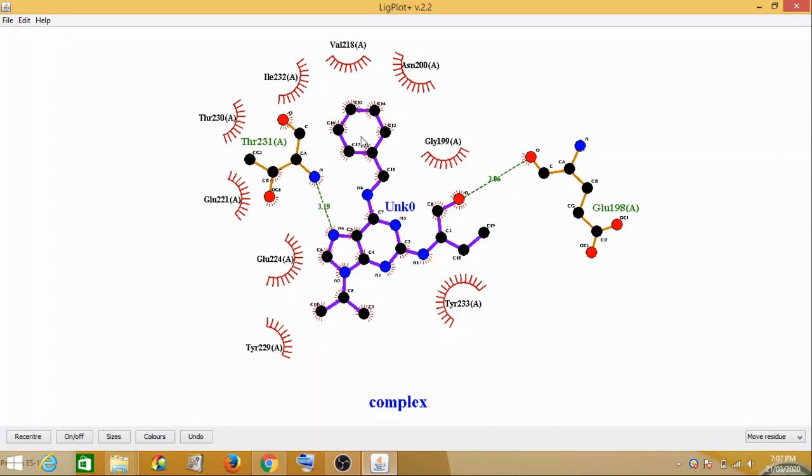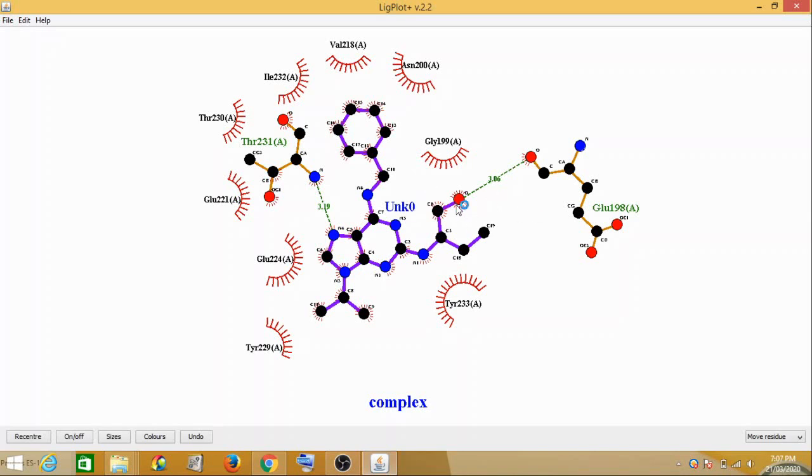So this is how you can find out what are the different amino acids with which it has interacted. So this is your protein and ligand interaction.